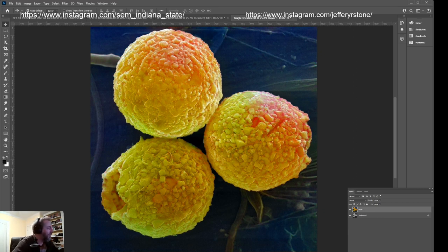So, okay, let's, I missed something here. So I'm going to come back into the chat, take a look. Desiccated state of tardigrades is pretty similar. That's a tun state. You're cleaning up.